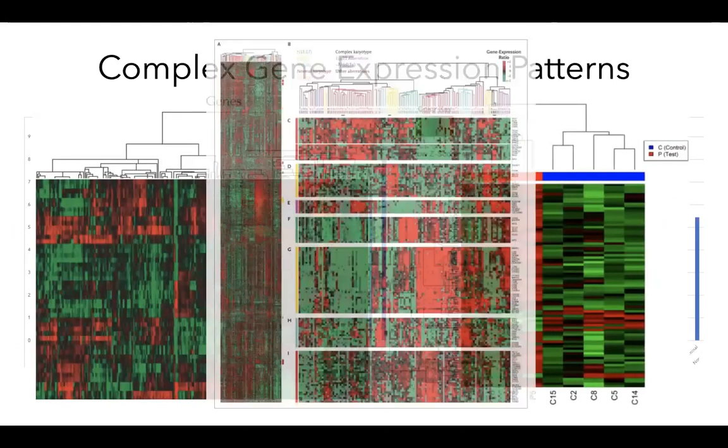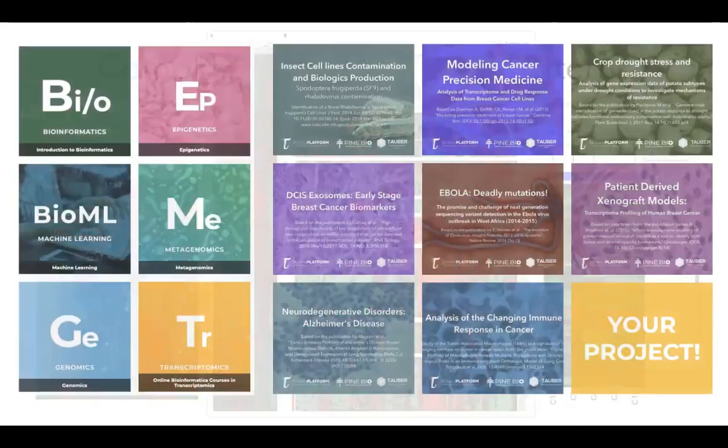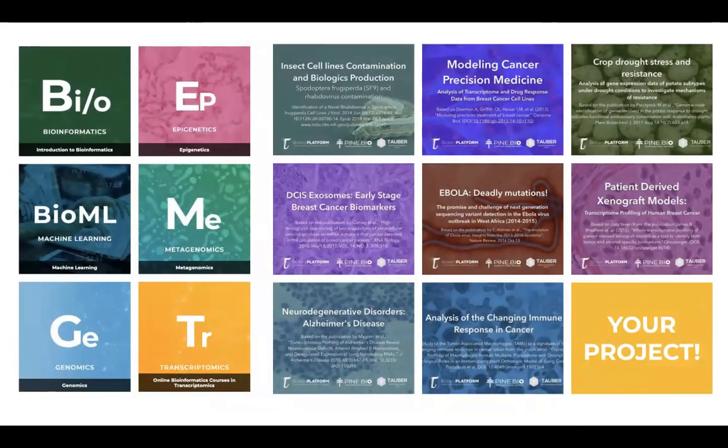And we talked a little bit about some of this variation last time. So two options for those of you that want to move on and explore how all of this works in other projects. We have some data sets that were already compiled in tutorials that you can go through. So these are the projects that are made available.